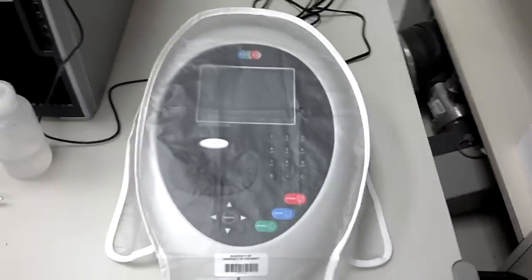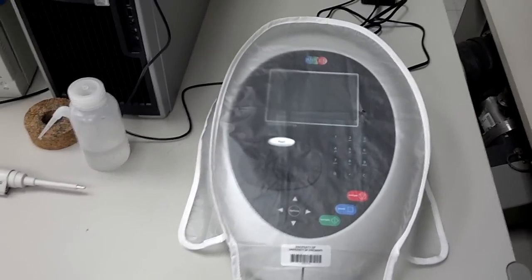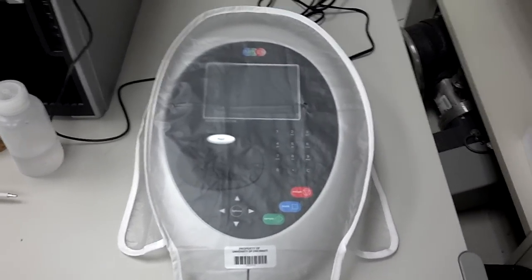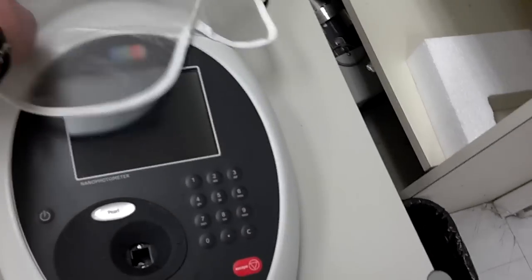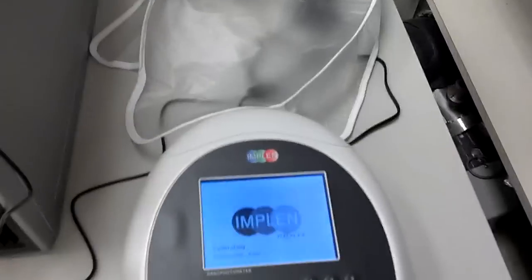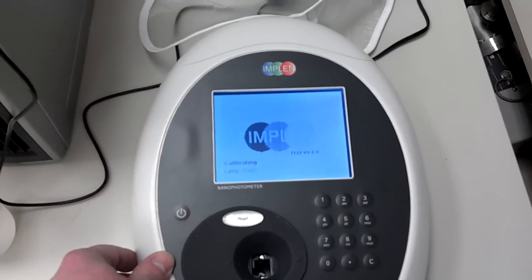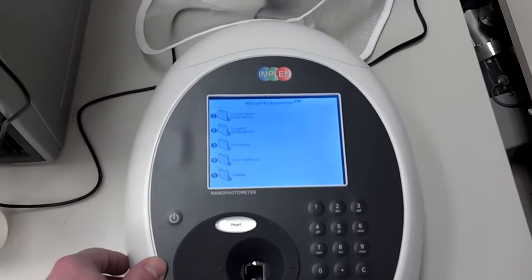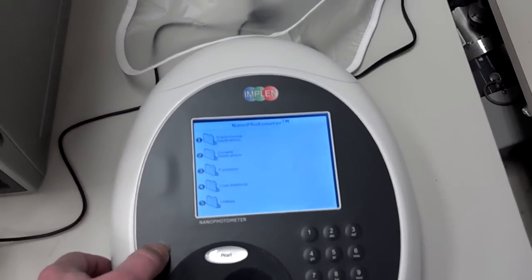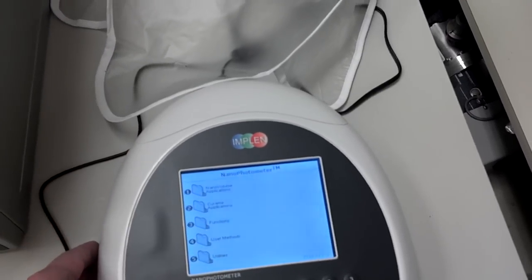This is our spectrophotometer. This is what we use to see if our proteins are really in solution to determine their concentration. We also use it to find cell counts to see if our cells are in stationary phase or still growing.